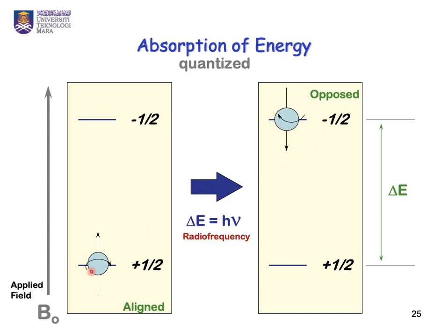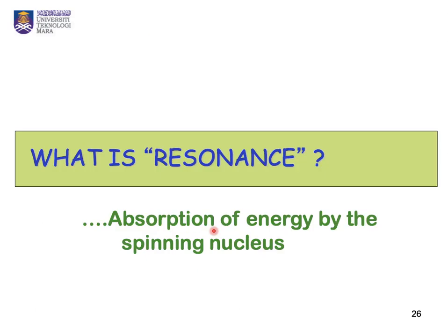This is only possible when radio frequency is applied to the system. Only after absorption of energy will this excitation occur. This phenomenon is called resonance, the absorption of energy by spinning nuclei.